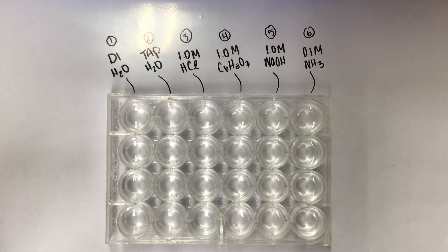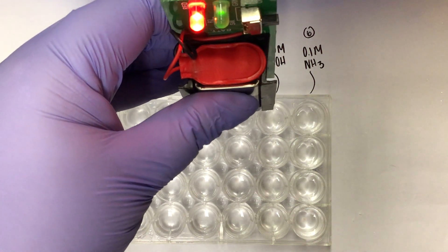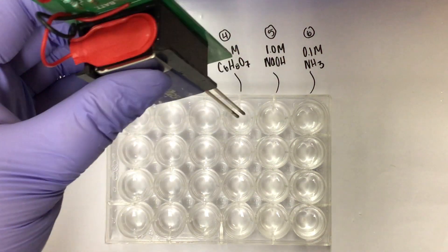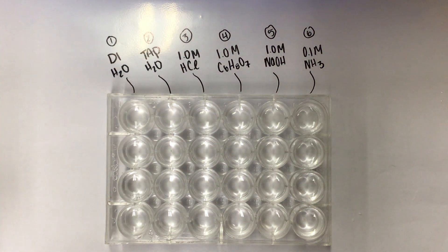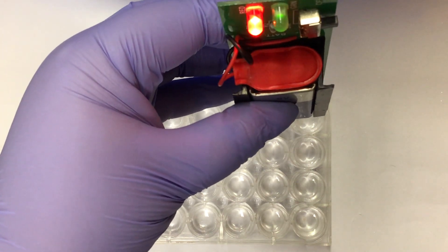Next, 1.0 molar C6H8O7. Both lights light up. Next, 1.0 molar NaOH. Both lights light up.